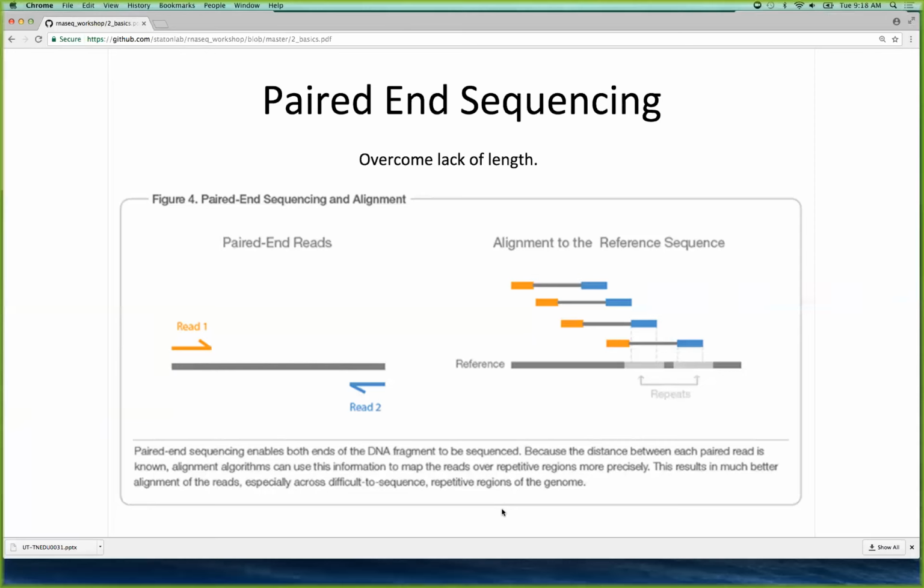The gray length, we have no idea. We don't sequence through it. Two samples, right? Left and right. Yep, you'll get forwards and reverses.